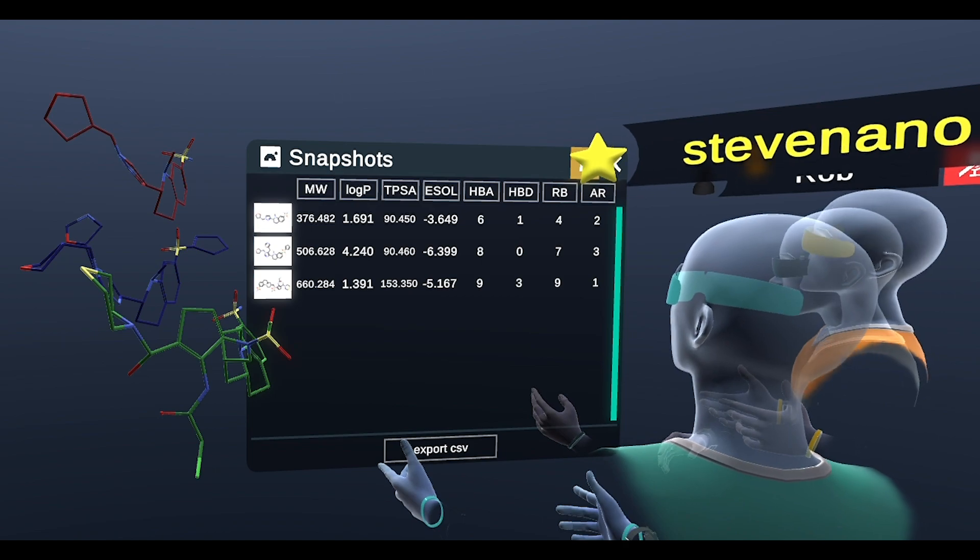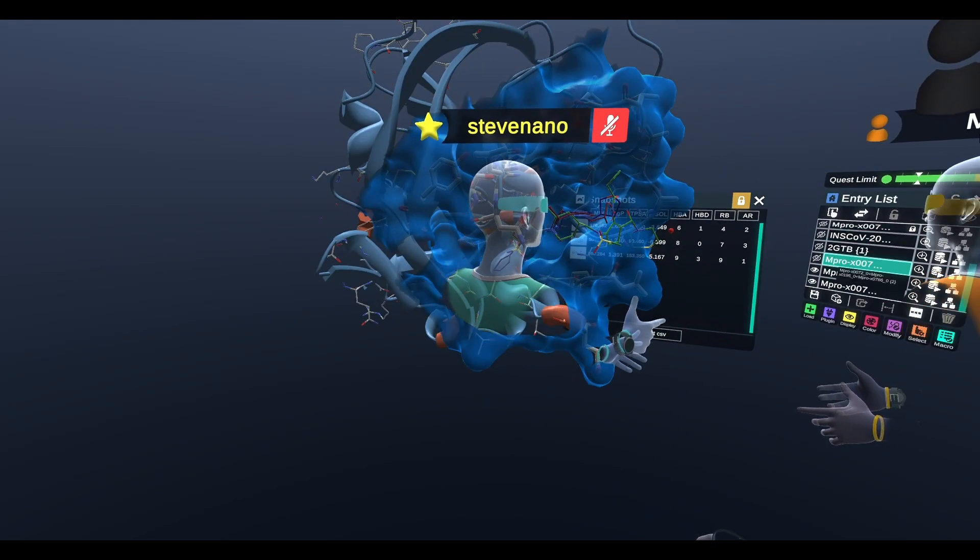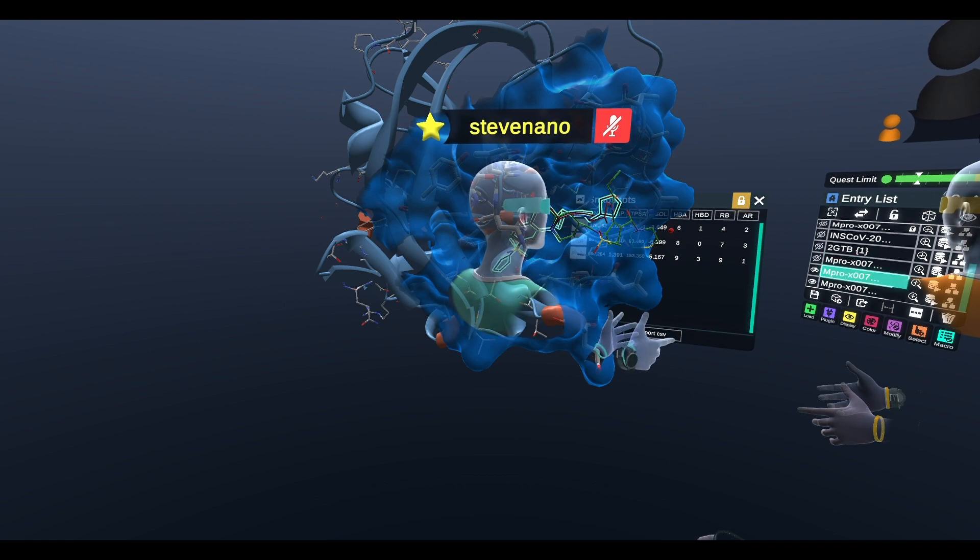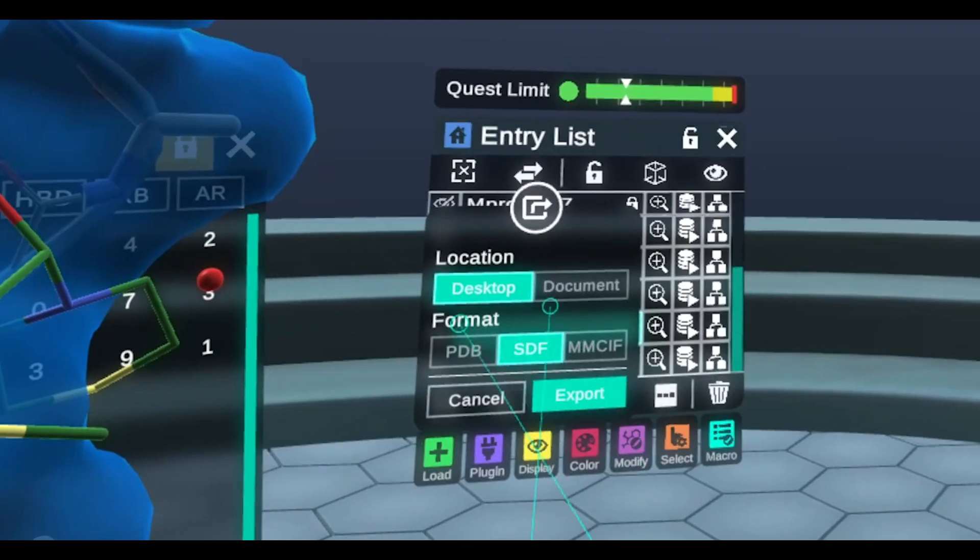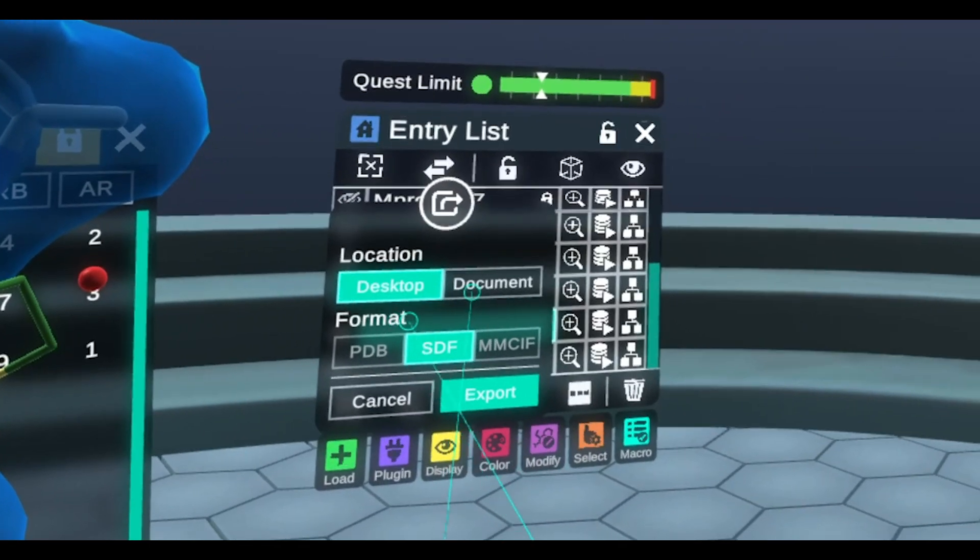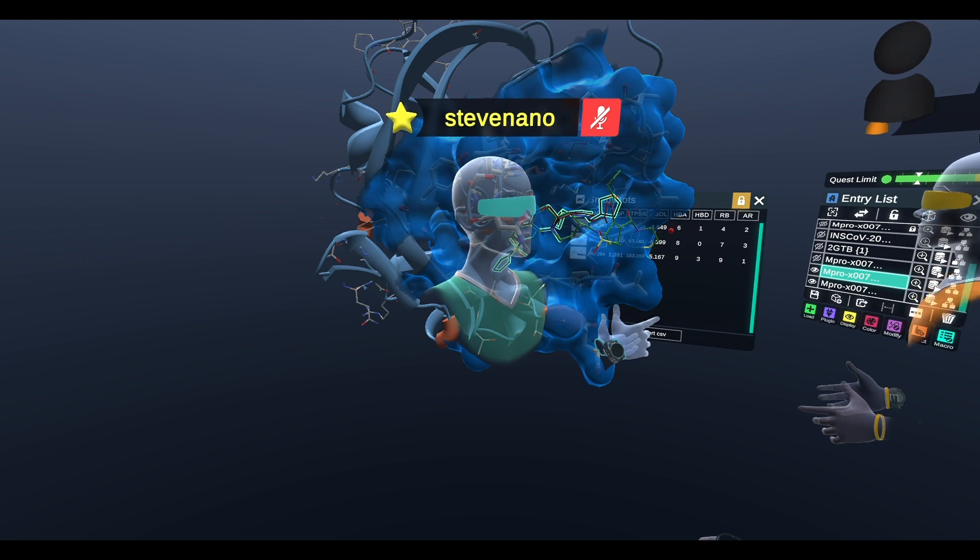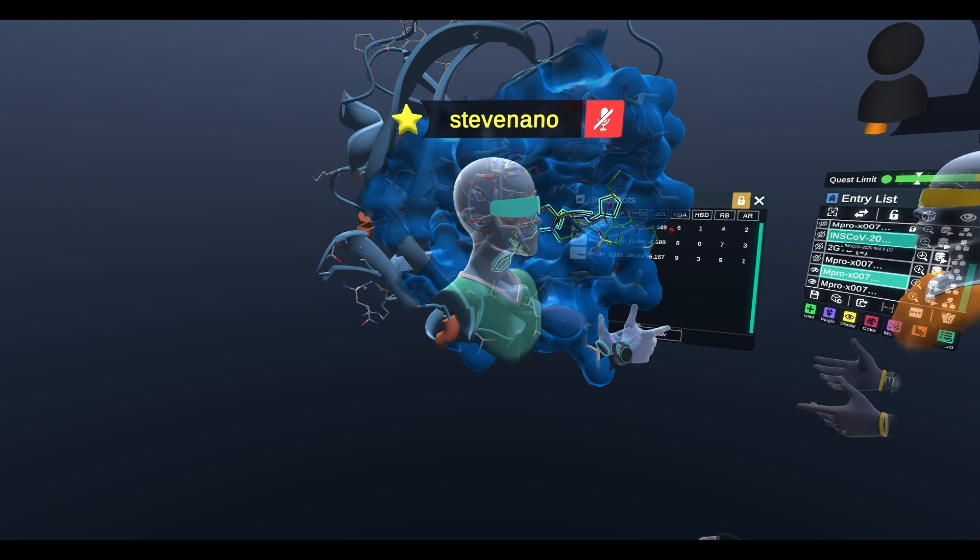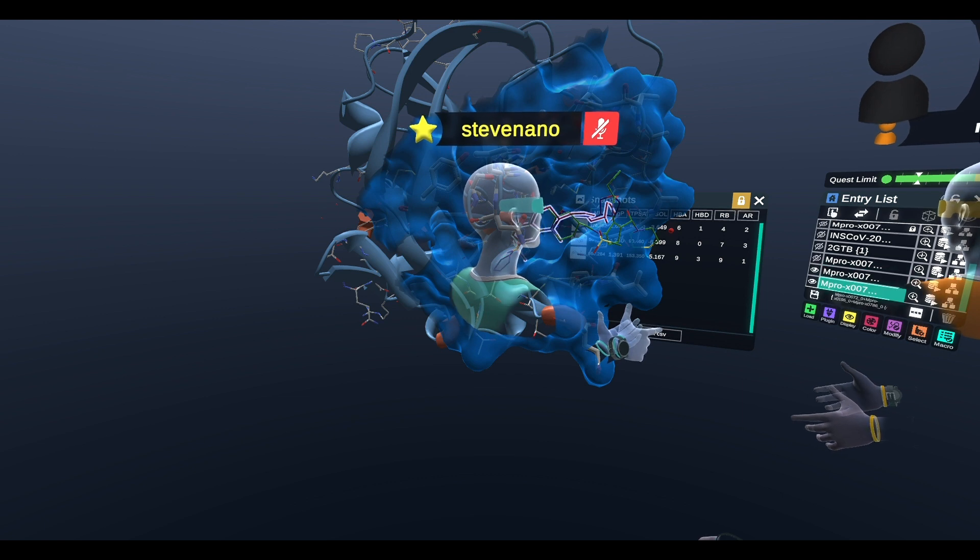All right, and so now we should export all these structures, and so I will go ahead and select—this is Rob's structure—I will click the export button and I will export it to my desktop as an SDF. In 1.17, the next release, we will also be able to export as a SMILES string as well. So now on my desktop I have all three of these structures, and I will be submitting them online to the PostEra.ai website.